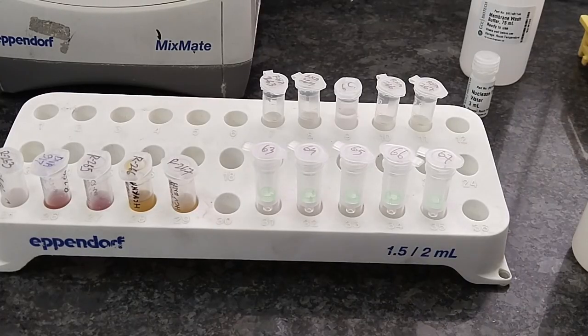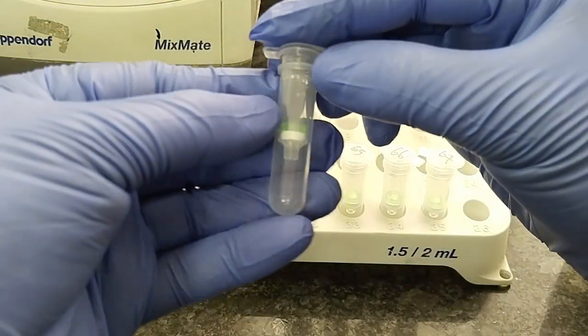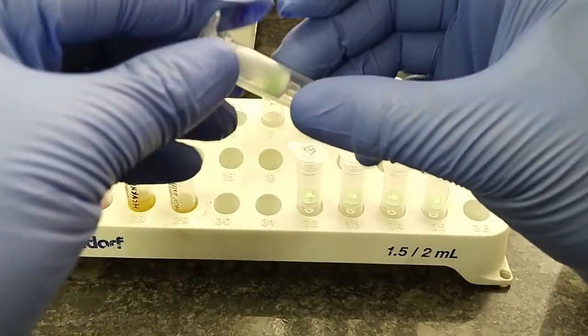Now vortexing is done. After vortexing, we have to take the RNA binding column. This is the RNA binding column.